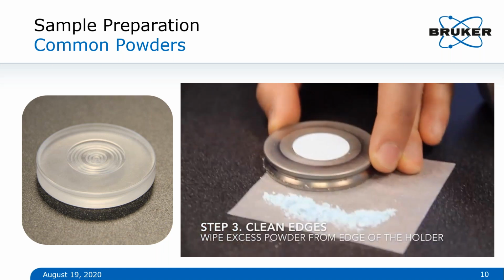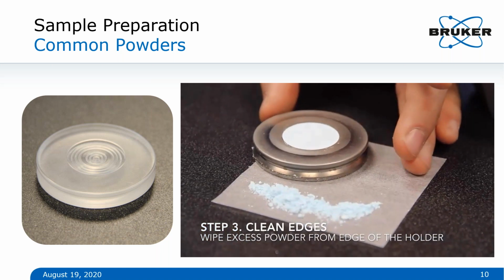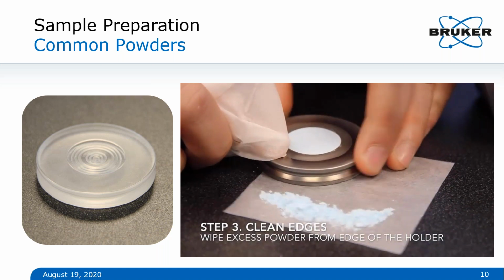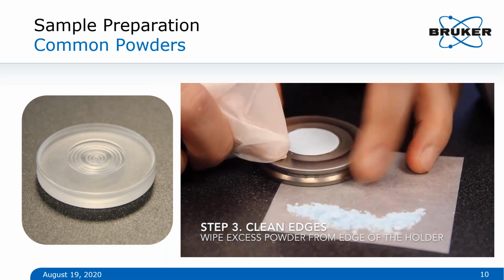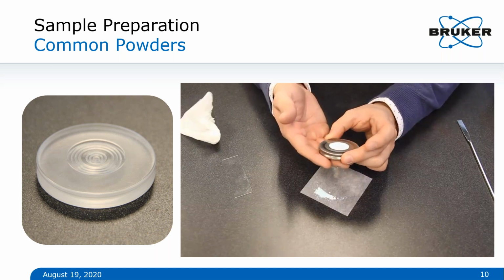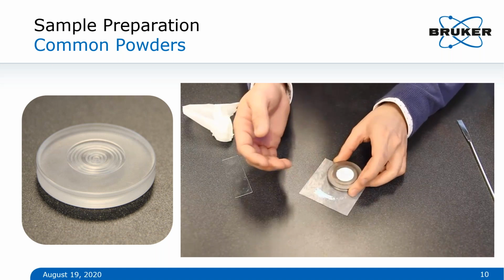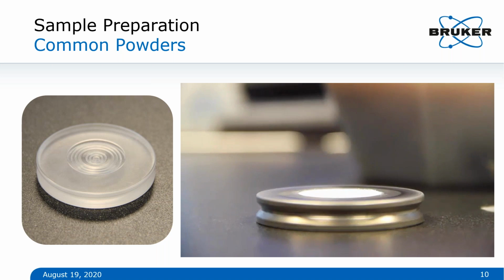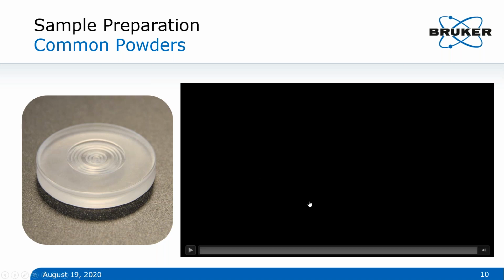Now, it's important whenever you're running these samples that you have a fairly smooth, homogeneous, fluffy powder. You don't want to have anything that's kind of crunchy. You don't want it to look like sugar or salt. It should be more like flour or powdered sugar, a very nice, smooth, even powder. No speckles, no variations in homogeneity. All right. After that, you simply load it into the system and you're off and running.